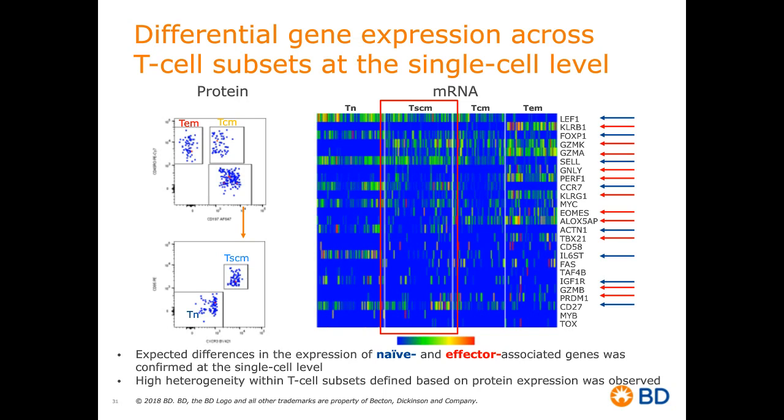Again, this strongly reinforces the concept that not all the cells that we've sorted within a gate are equal, and they have difference in the gene expression profile. Notably, you cannot find 2 cells that share the same profile, really emphasizing the need for a refined way to look at these cells and characterize these cells.